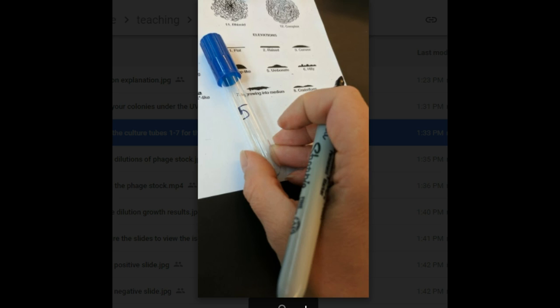You're going to label the sterile 5 ml culture tubes that have blue caps. Label the tube, not the cap. The cap, just like the lid of the agar plate, can get separated from the important part, which is the tube. You're going to label 7 of these. And remember that the microcentrifuge tubes are just really little tiny tubes, and the agar plate is a big plastic circle or square plate. And this particular kind of tube is called the culture tube.